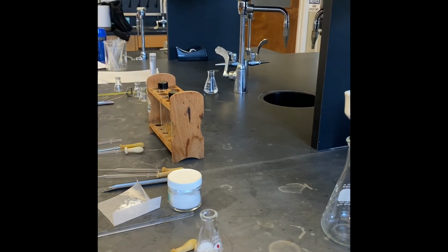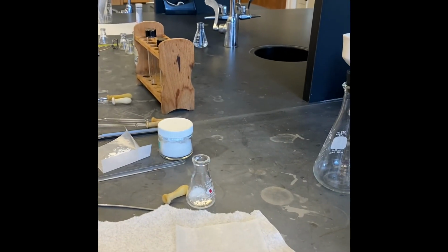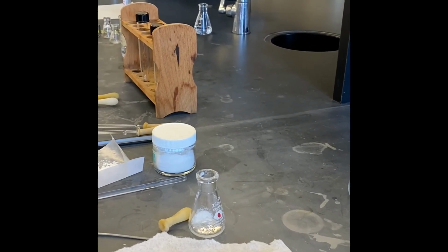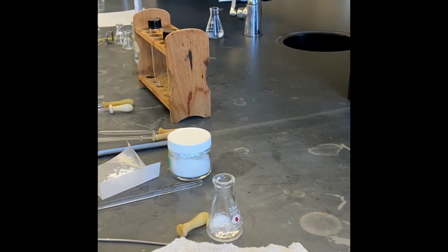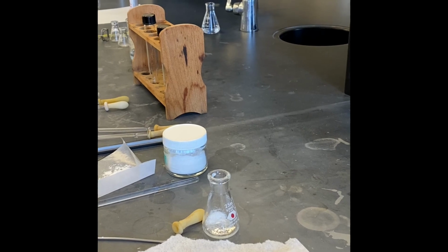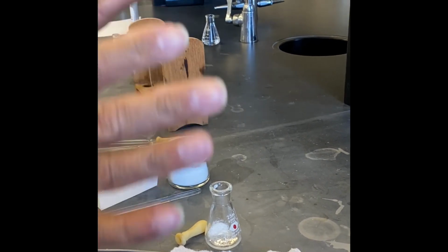Now your melting point should be at least the literature melting point. So if it is less, that means it is still impure. A pure compound has a sharp melting point, and if you get the right melting point, that is an indication that your compound is pure. Okay.